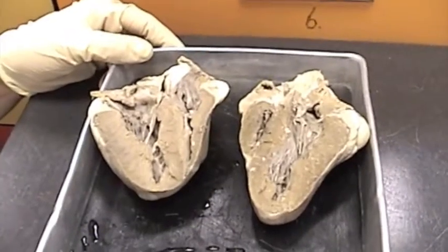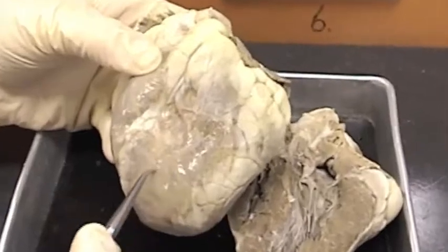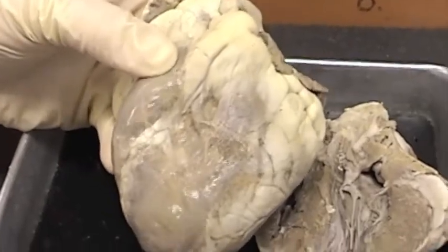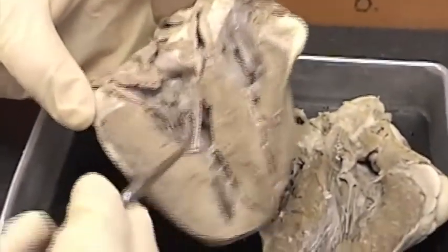Sheep heart. First I want to show you the outer layer. The first layer here that's kind of shiny is the epicardium. It's a serous layer that covers the heart — the epicardium is the outside layer.